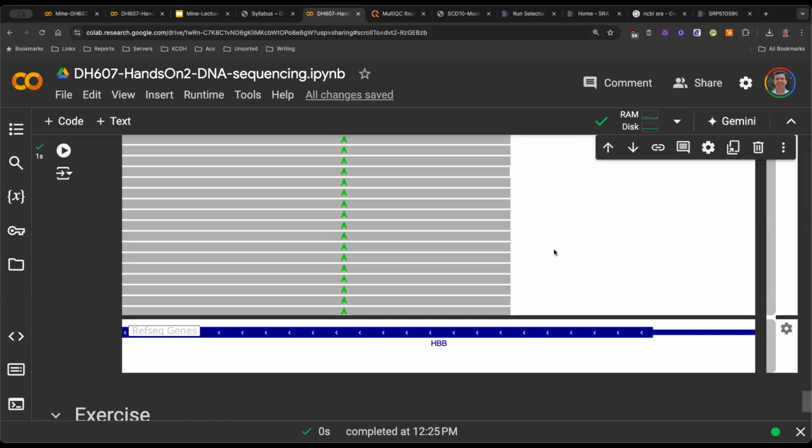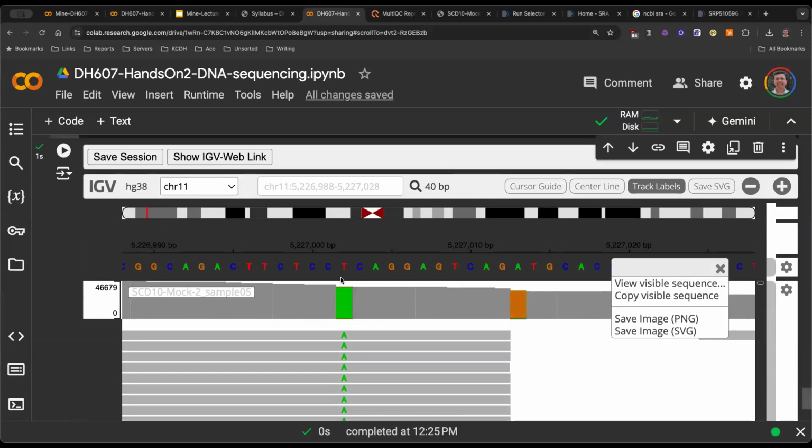Why is it wrong? Well, it's not wrong. The reason it appears to be wrong is because we are reading the reverse complement sequence as the reference here. The gene does not read in this direction. The gene reads in this other direction. So what you're seeing as T here is actually an A for that gene. Does that make sense? This C is what? G, and so on.